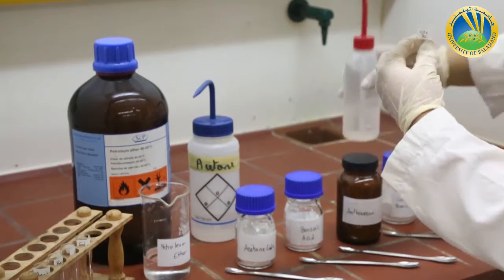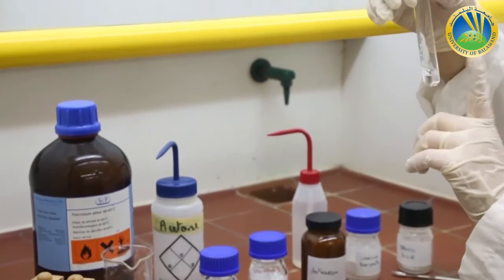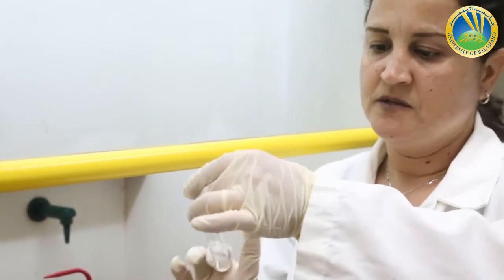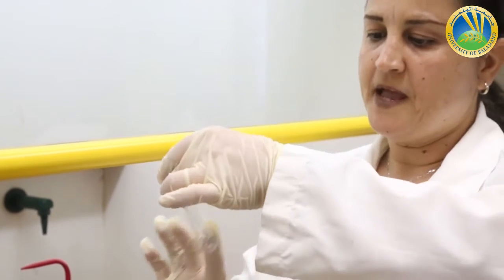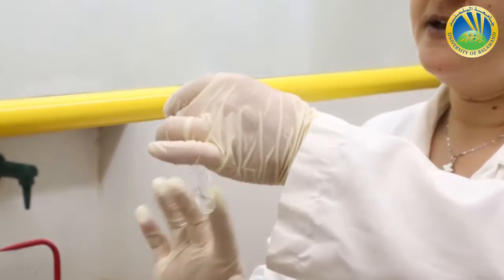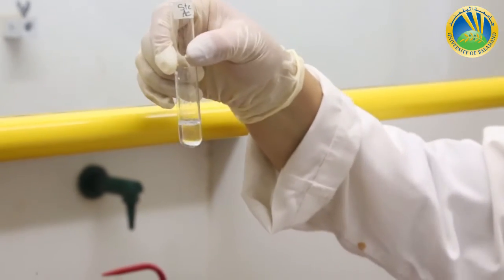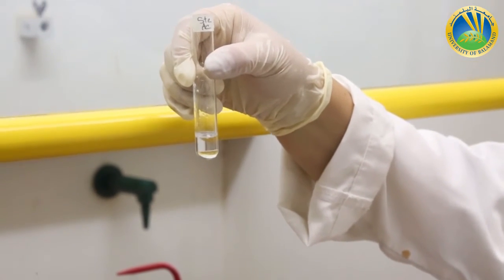So first I have to test the solubility at cold. What should I do? I just have to shake well my test tube like this. I can see clearly that this stearic acid is not soluble inside water at room temperature because I still have too many crystals at the top of my liquid.